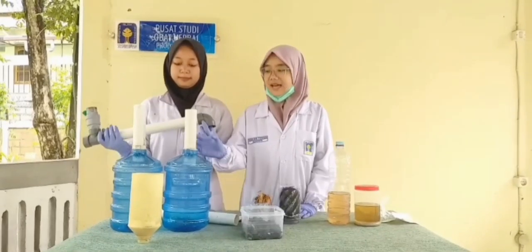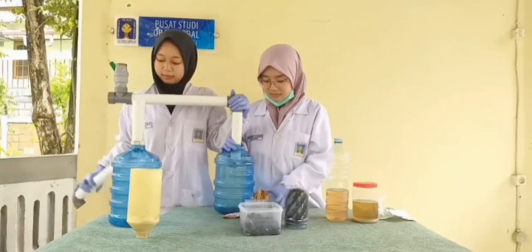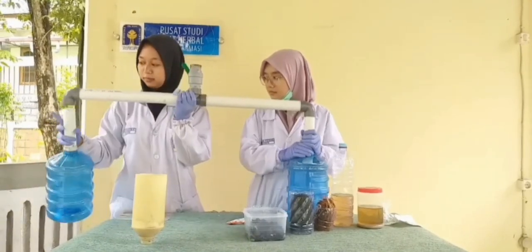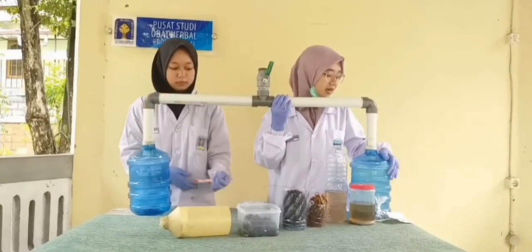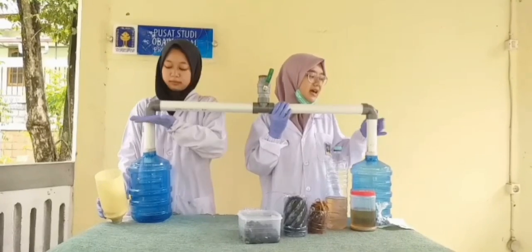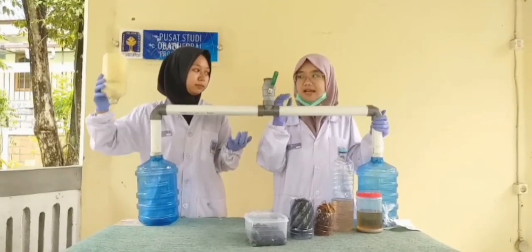Pertama-tama kita rangkai alat yang bagian bawahnya dengan yang bagian atas. Di bagian bawah ini merupakan galon mini, yang merupakan alat penampung dari hasil olahan limbah tersebut. Kemudian bagian dari paralon ini — di dalamnya ada saringan untuk limbahnya. Saringannya itu ada 2, yang di bawah dengan yang di atas.